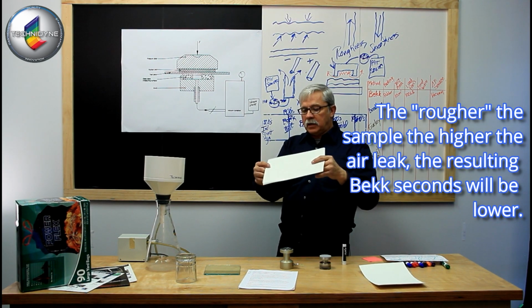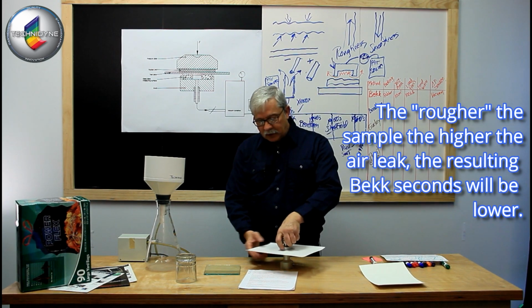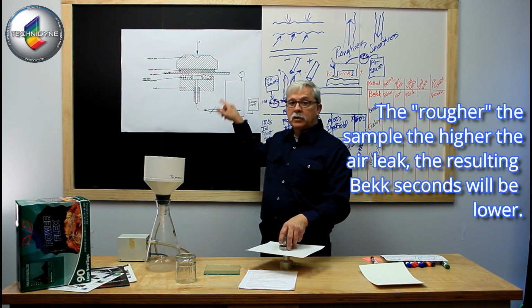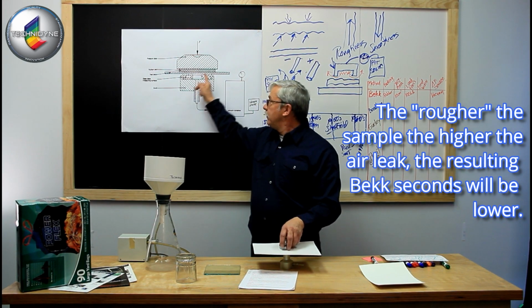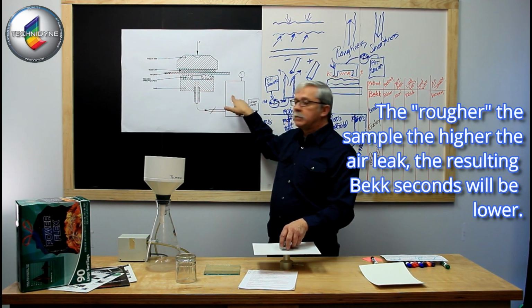You can imagine that if I clamp this into my sandwich, I'm going to have a fairly low flow rate into my chamber, and it's going to take quite a long time. Let's say it takes 200 seconds to evacuate 10 milliliters of air across the surface through my tunnel into my chamber.